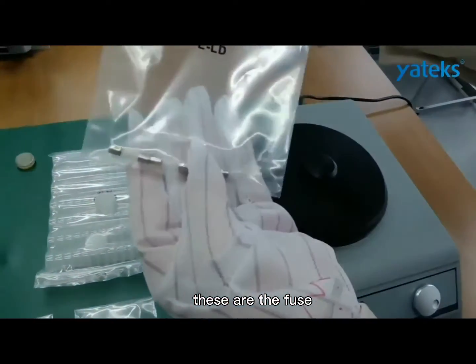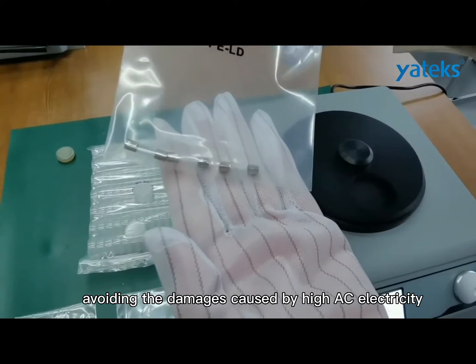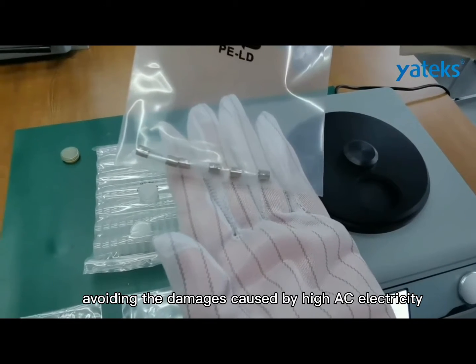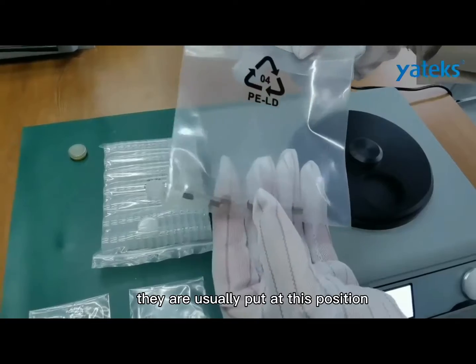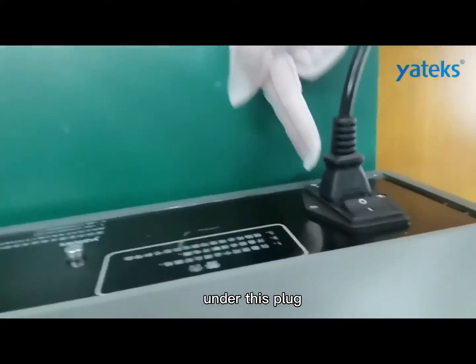These are the fuses. They are mainly for avoiding damage caused by high AC electricity. They are usually placed at this position under this plug.